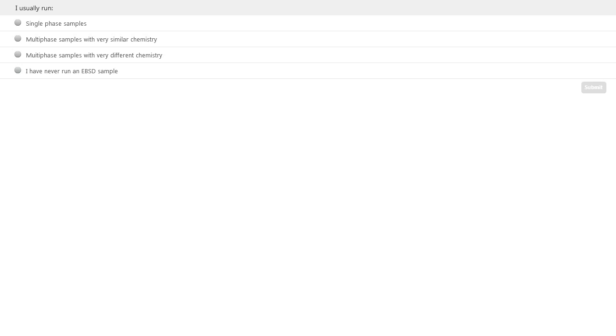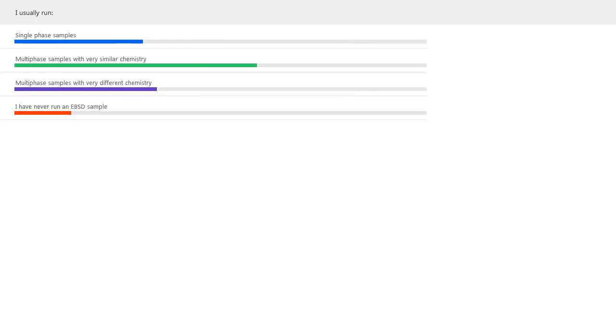Let's go ahead and see what our results are. So about 22% of you are using single phase samples. Sounds about right. I know there are companies out there that all they do is steel or single phase aluminum, so that's pretty common. Multi-phase samples with very similar chemistry, again, about what I suspect.